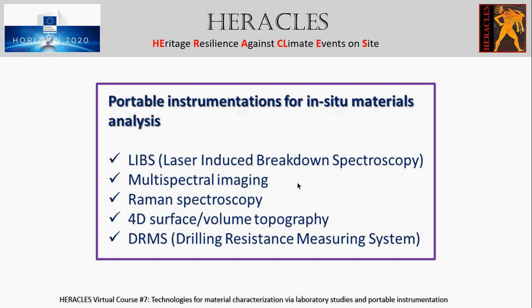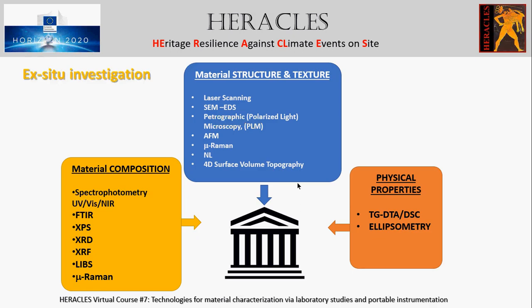While referring to ex situ investigation, the laboratory materials characterization is performed by a multitude of different analytical procedures and allows us to assess different properties such as composition, microtexture, porosity, and so on. Therefore, it is crucial to select the appropriate method or combination of methods which ensure the most effective approach to document the materials degradation issues.